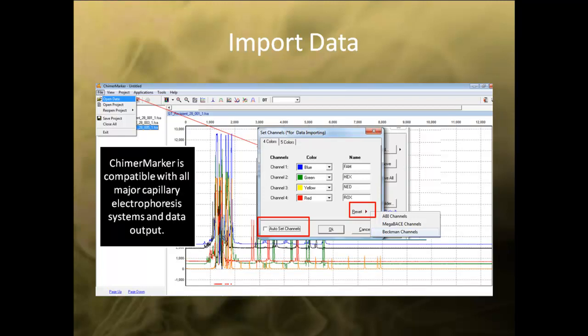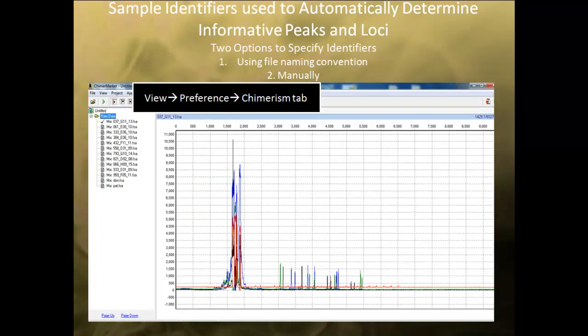ChimerMarker is compatible with all major capillary electrophoresis systems. After importing the data, the list of files will be located at the left side of the screen, and the electropherogram of the raw data for each trace can be viewed by clicking on its file name.